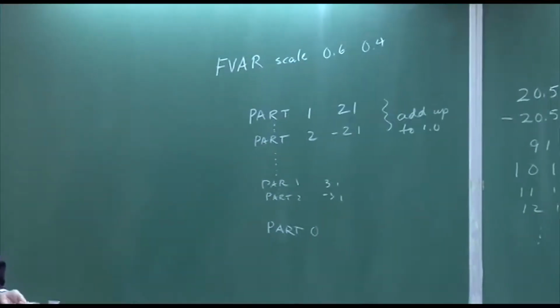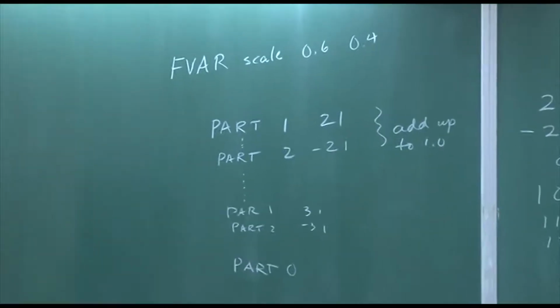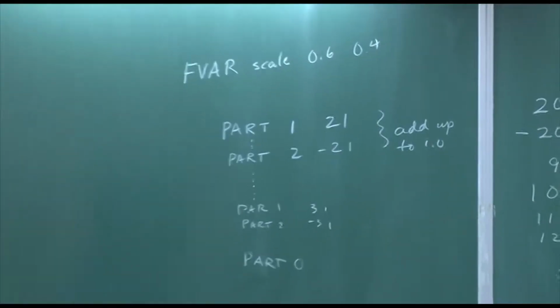You can have a benzene and a chloroform on top of each other very easily in a structure. That's common. So you've got actually 2 different kinds of molecules, but it could be 2 different orientations of the same molecule, like 2 toluenes that are disordered. That happens a lot. Now, there's no limit to the size of the thing. It doesn't have to be a solvent molecule. Like I showed you a whole molecule disorder in one structure where the whole molecule was disordered and they had to be parts.